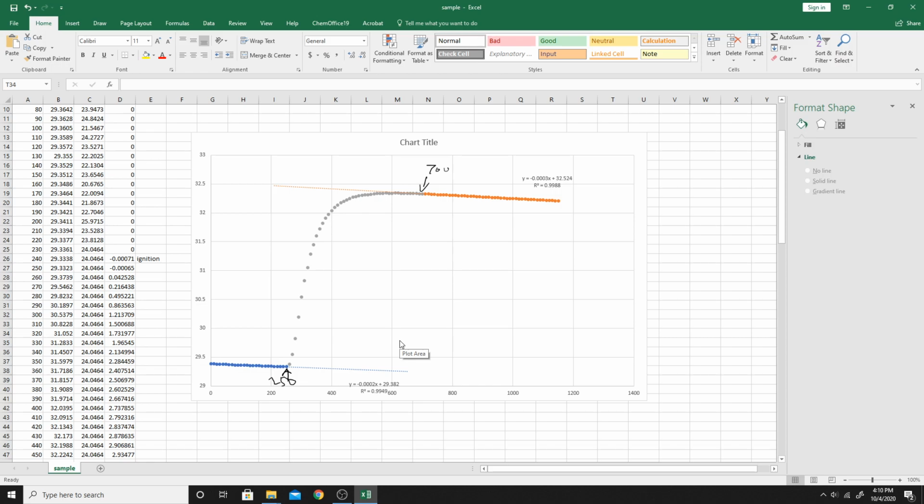So somewhere here, 475, and we need to find a vertical line. So find the vertical line at the midpoint, and then the intersections give the estimated temperature change. So this is the temperature delta T. Okay, all right. So let's put it here.